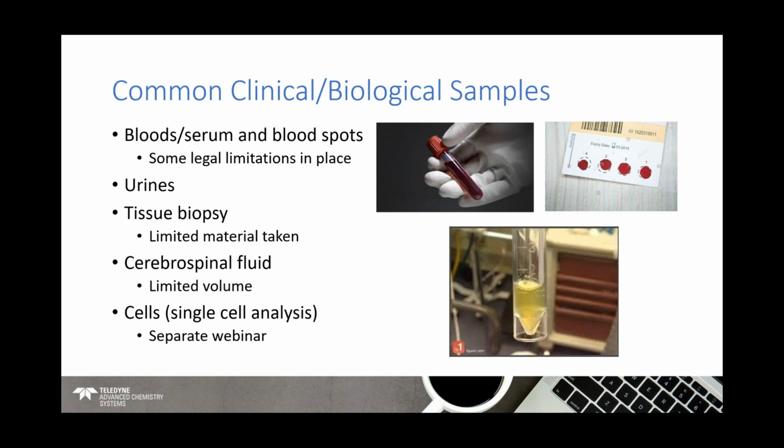but typically there is an abundance of sample volume for that, so there's no issue there. However, there are some legal limitations on that kind of sample when you start considering babies and infants, for example, or someone who is immunocompromised, where taking actual samples is going to be more of a limitation. In that case, the MVX can start actually being an advantage to that kind of sample problem.